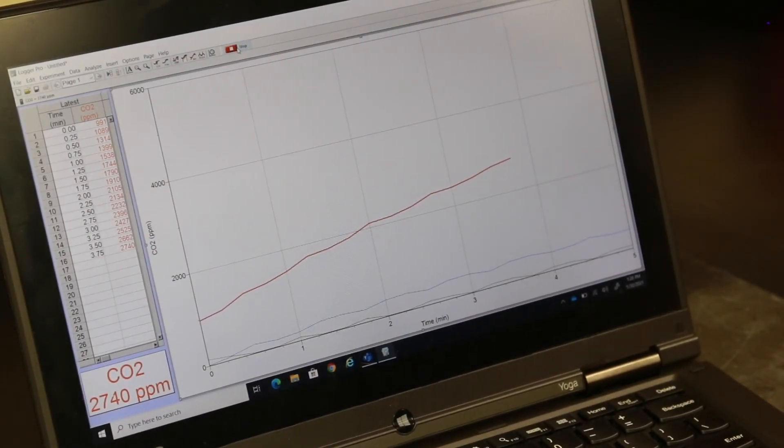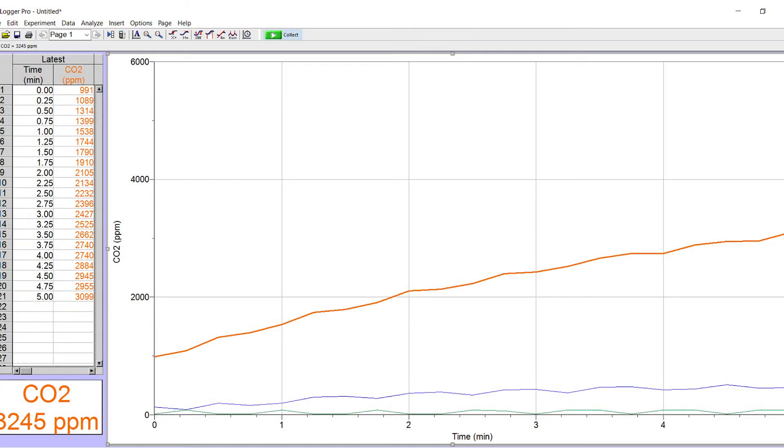We can now see the data collection occurring on the Vernier software. The red line is the increasing CO2 levels from the germinated peas.